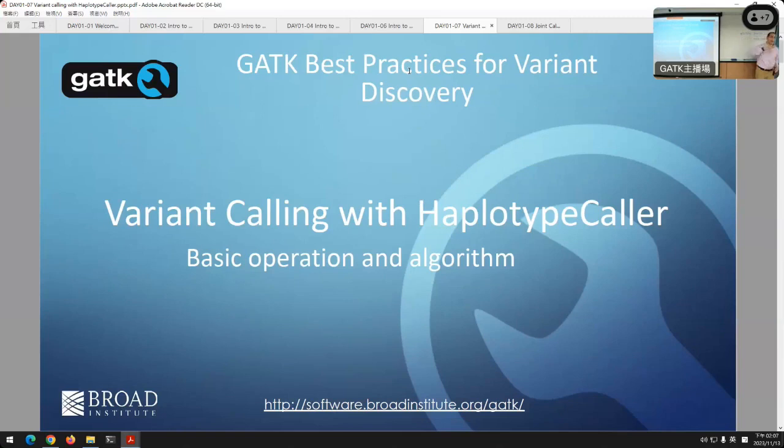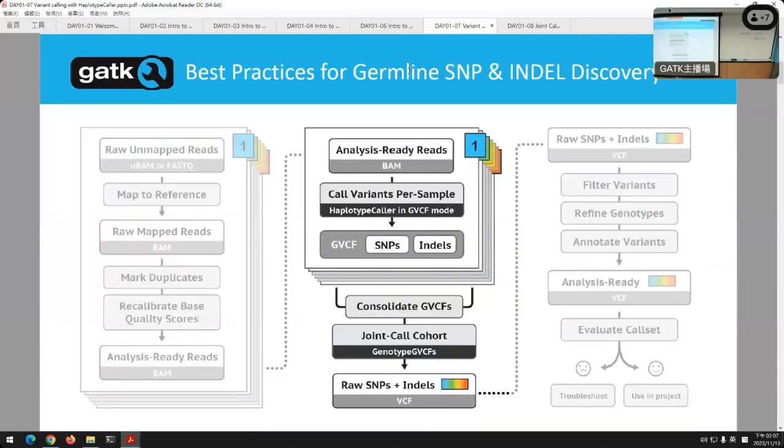I'm going to give you a high-level overview of it. You'll hear about this again, but just so you understand, the GATK is open source. So multiple different companies took our open source code, as they are allowed to, and made it faster, different, and some of them have shared back differences we've collaborated with. That's in particular the Dragon. So you'll learn all about what changes went into the HaplotypeCaller tomorrow or Wednesday. Now let's just focus on the high-level overview of this.